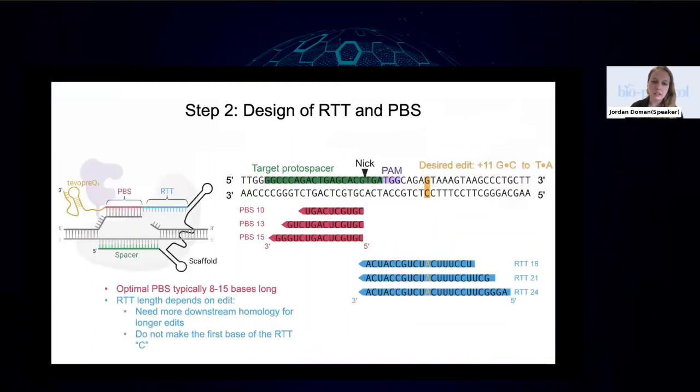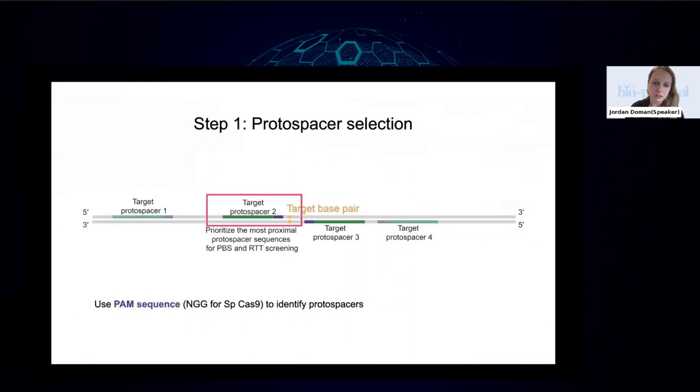But one of the things that's important to remember when asking those types of questions is that, unlike base editing, where you really need a PAM to be in a certain spot, you have a lot more flexibility with prime editing. For example, if you're trying to edit this target base, you can do it from either strand.